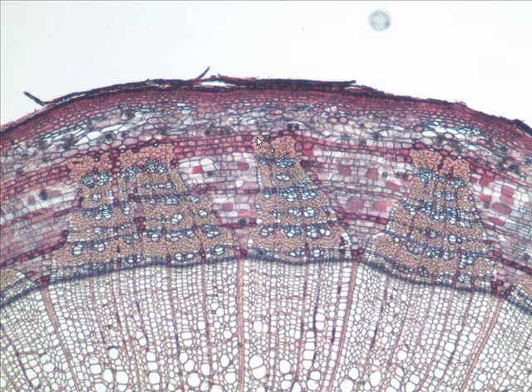So we back up one, we see both in this picture. Which cambium down here? Vascular cambium producing what to the inside? Secondary xylem to the inside, secondary phloem to the outside, and up here the what cambium? The cork cambium producing what? Producing cork or bark to the outside, and a soft, parenchyma-type tissue to the inside. Ladies and gentlemen, that is your Tilia 3-year-old stem cross section. All right, that's it.